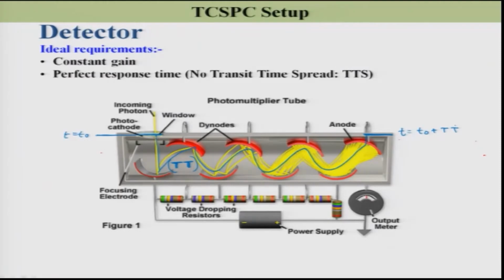But now, these photocathodes have some dimension. This is the dimension of my photocathode.